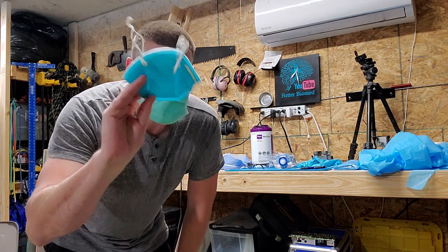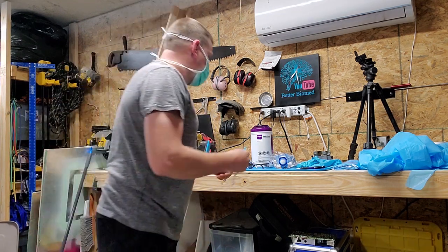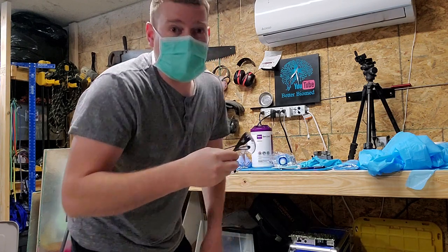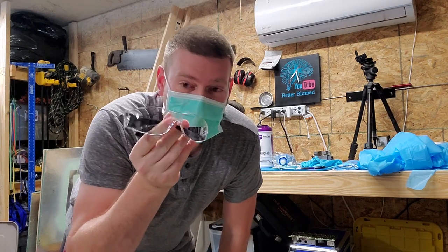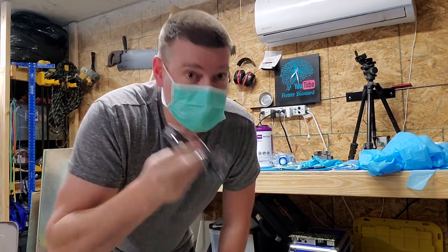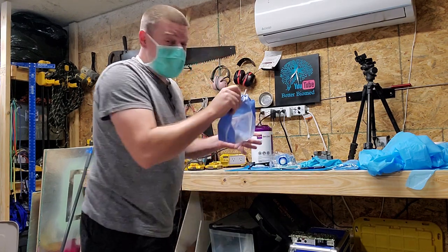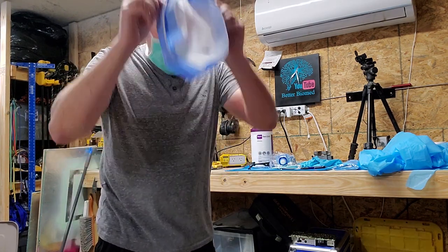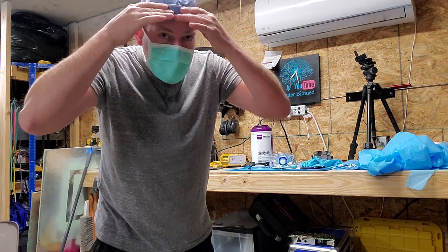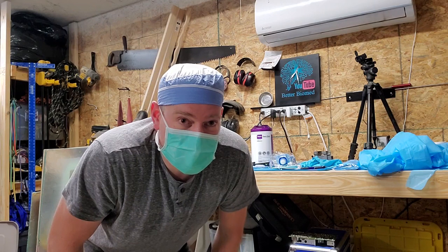You're going to need a more proper mask, an N95 mask. So I've got one of those. If you're going to go in a COVID room, you need some sort of eye protection. Usually it's a face shield, but if this is all you got, then you're going to wear it. I myself, when I go into those rooms, I wear headgear, just like I do when I'm in surgery.